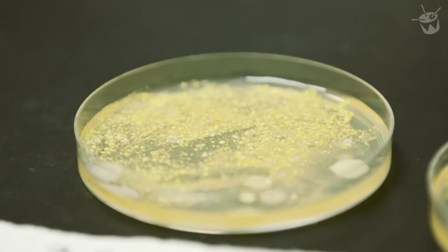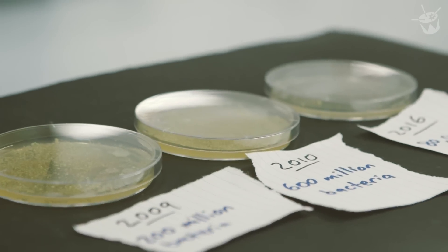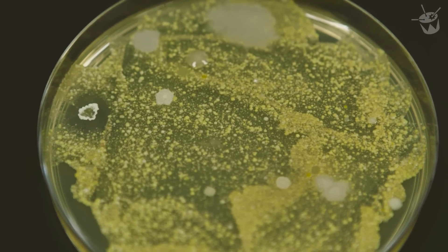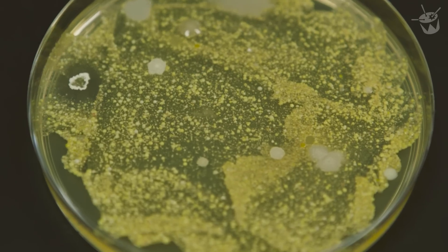So these wristbands have just picked up junk from the environment as well as flora from our bodies. But you can also see some more orangey, golden ones — that could be golden staph, and that one can cause wound infections, boils, impetigo, food poisoning, a range of conditions. What's really cool on this plate, though, is we've actually isolated a bacteria that makes antibiotics. See how there's nothing growing right next to it? This one's actually making something that's killing the other bacteria. This is how antibiotics are discovered — a pretty cool little accidental finding.